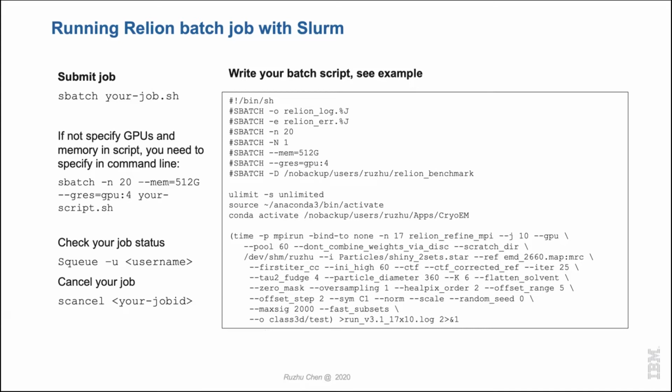People tend to be curious about their results, so they want to start by running the whole thing faster to get a result. If they see a good one, they tend to run the regular job. That is why the people at MIT recommend these two parameters, though they may not give the best result.